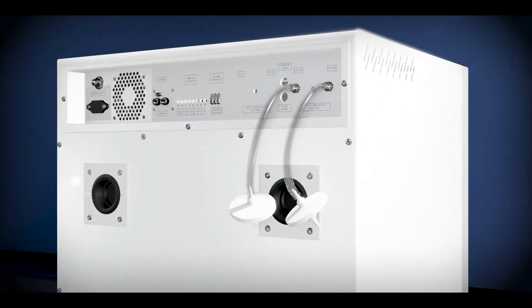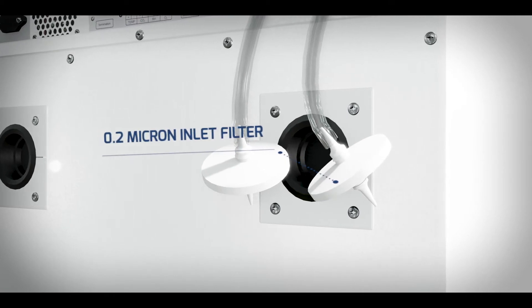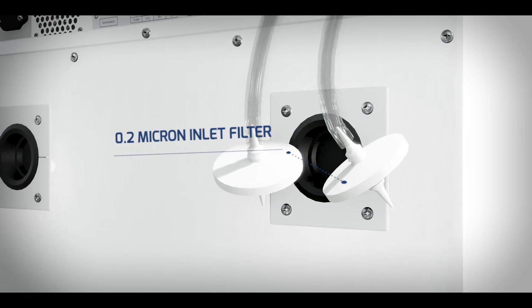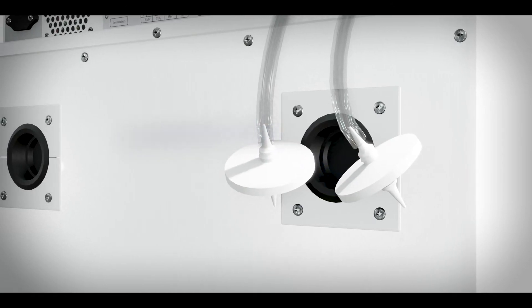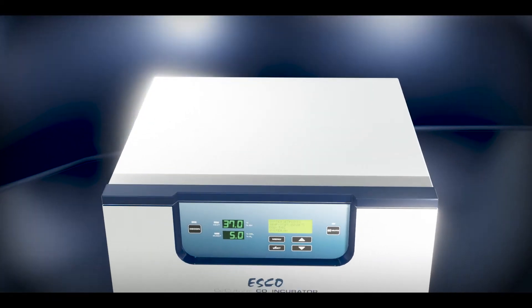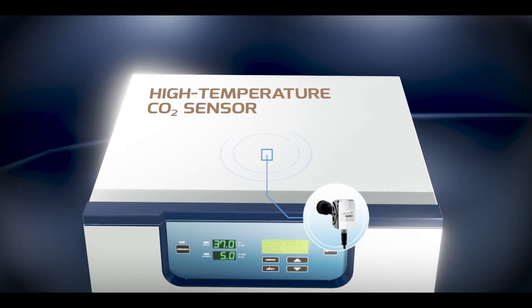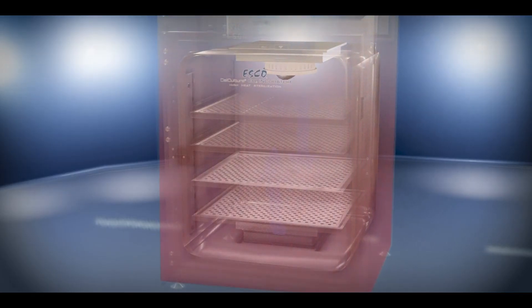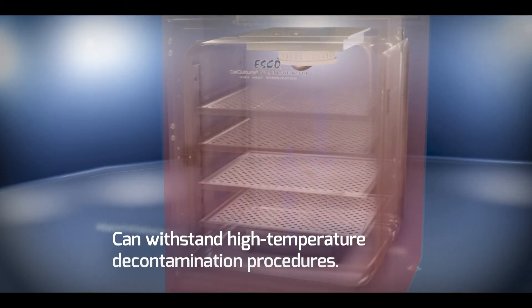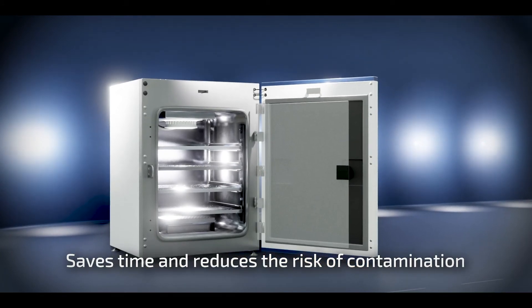The Cellculture CO2 Incubator with High Heat Sterilization has gas injection lines that are filtered via 0.2 micron inlet filters to remove impurities and contaminants before being injected into the chamber. It is installed with a heat-resistant CO2 sensor that provides accurate and stable measurements. This highly accurate sensor can withstand high-temperature decontamination procedures without the need to remove any component, saving time and reducing the risk of contamination.